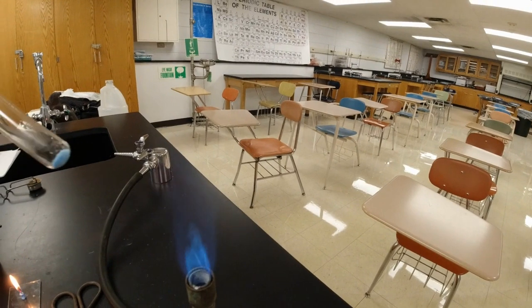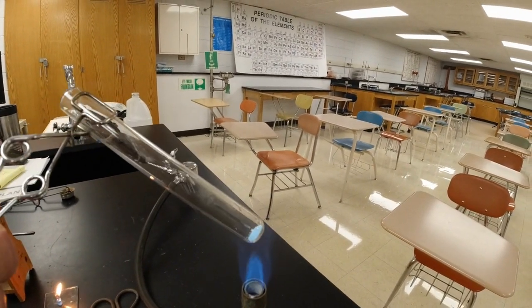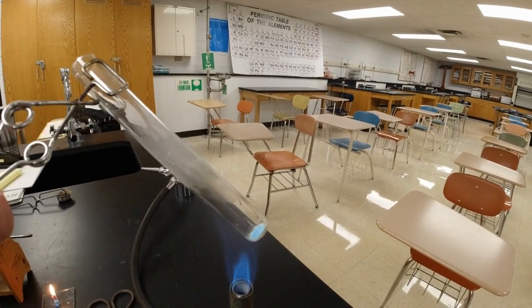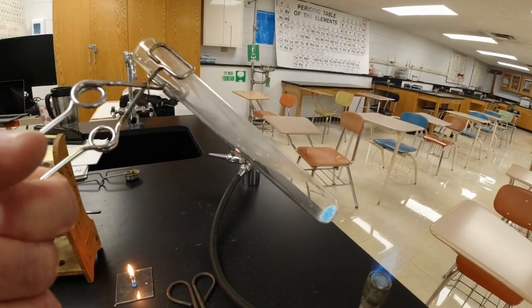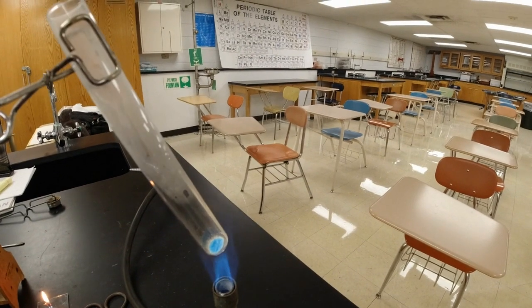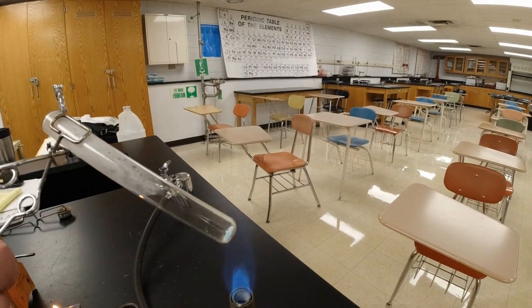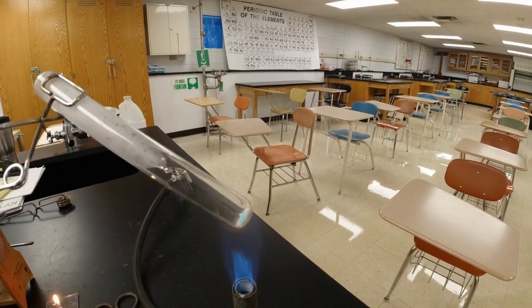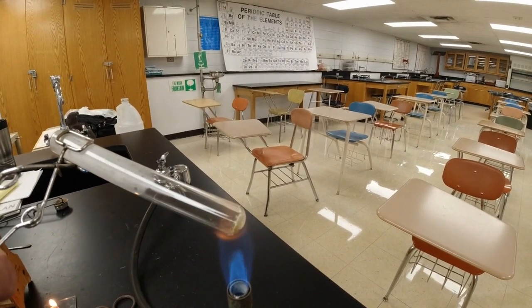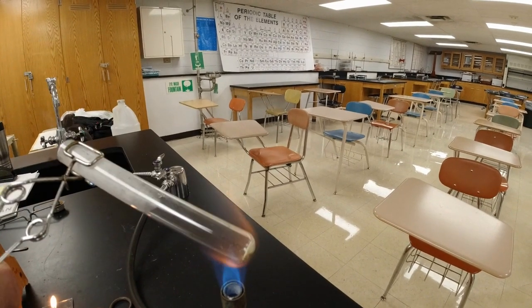Now, as soon as I put it over, there was like a little puff of steam that came off of there. I don't know if you guys can see that, but it's getting kind of steamy looking at the mouth of the test tube here. And there's all kinds of condensation here. And if I look at the blue crystals closer, they're kind of changing in color a little bit. So I have steam coming off of this. And as I heat it up, the blue crystal's turning lighter and lighter in color. So let's see if I can get all the blue off of that.